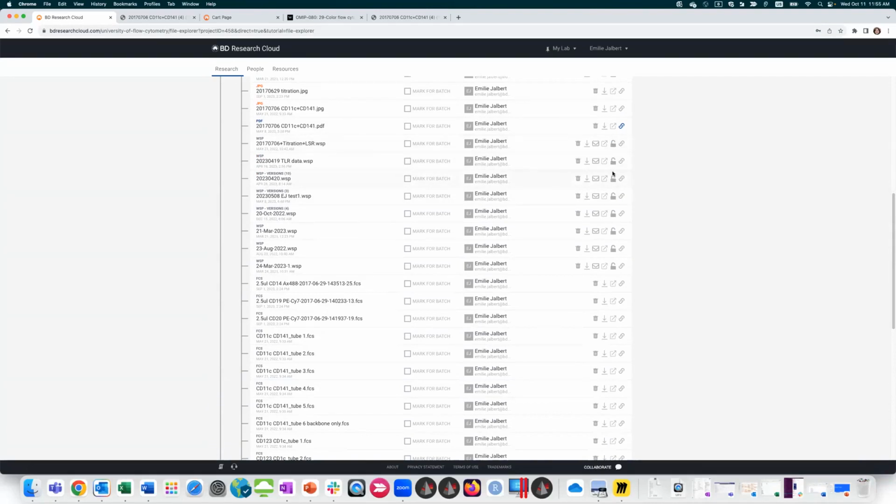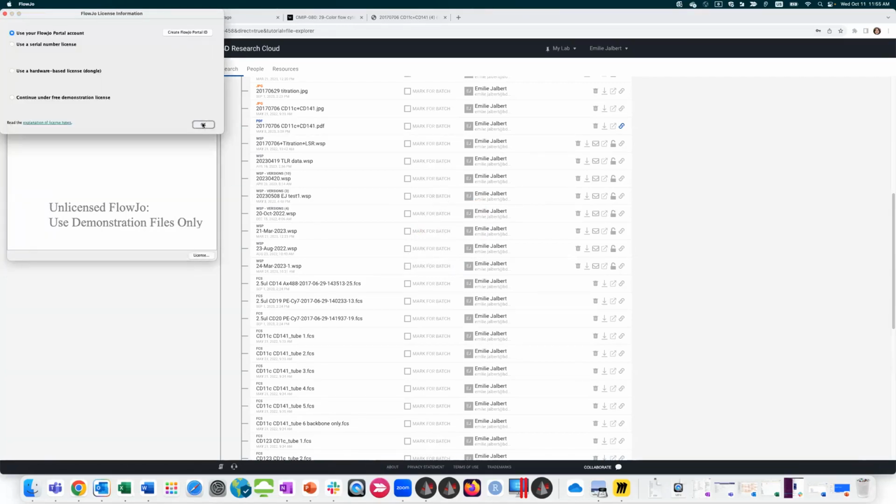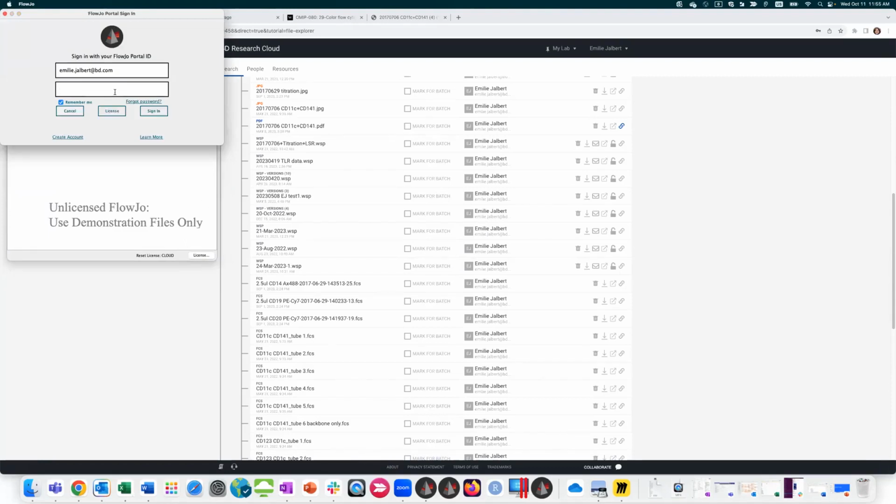So if I'm working on them and I want to ensure no one else is looking into this workspace at the same time as me, I can choose to do that. I can email it, things of that nature. So I will just kick off FlowJo to show you how this starts. I have a FlowJo portal, but you don't have to. If you have a dongle license or serial number license, you can still connect to BDRC. You'll just have to enter your BDRC credentials separately. For me, since I have a portal account, I just enter that information at this point.